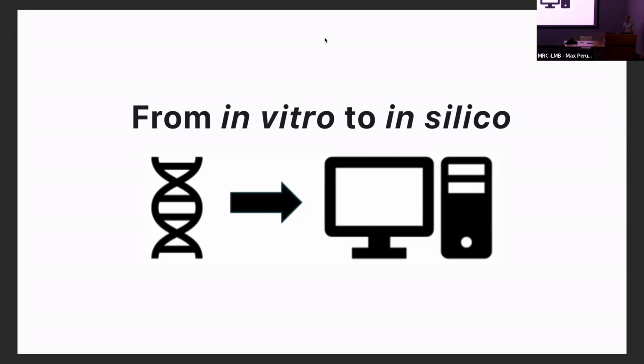You need to know how many reads you're getting back, and how the reads relate to one another. So it's really important you understand the constructs before you sequence them, so you know the correct analysis that you need to perform. So don't just think of it as two disconnected universes. That's what this next part of the talk is about.